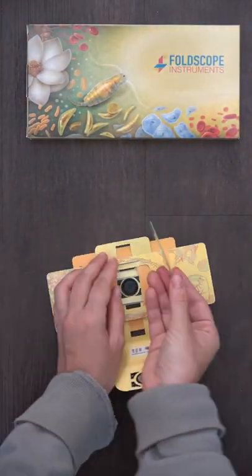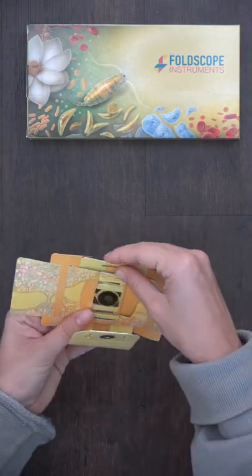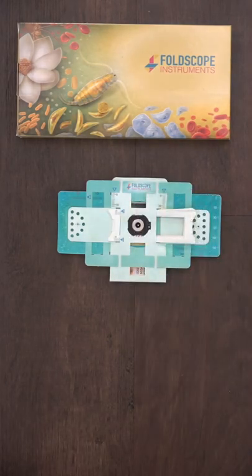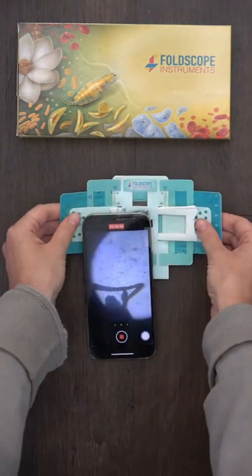Grab your Foldscope and put your sample in, sample side down. Grab your LED light and couple it onto the back of your Foldscope. Grab your phone cup or tool and be prepared to be absolutely wowed by the sample.